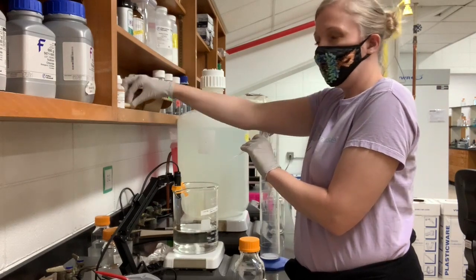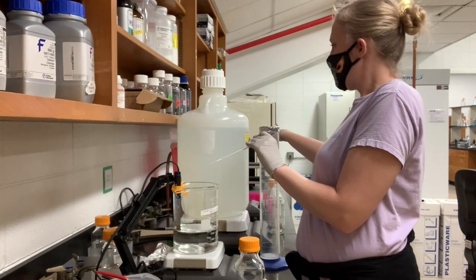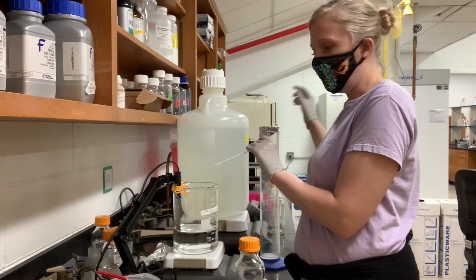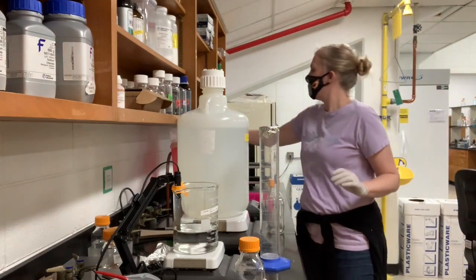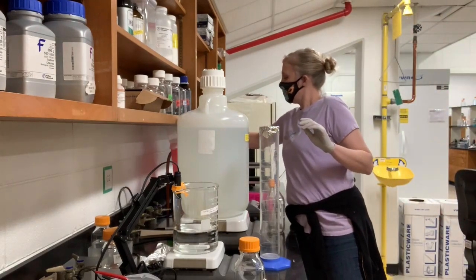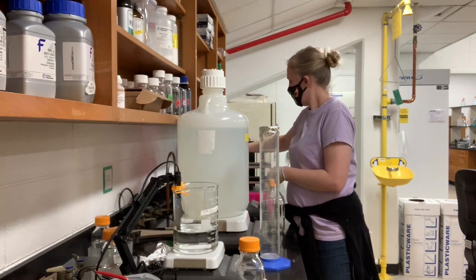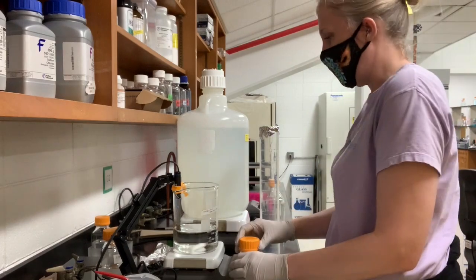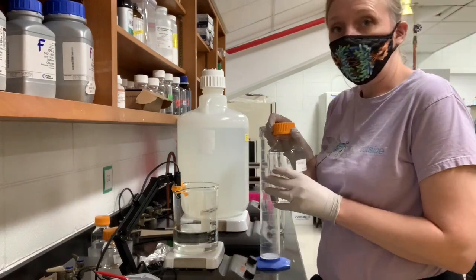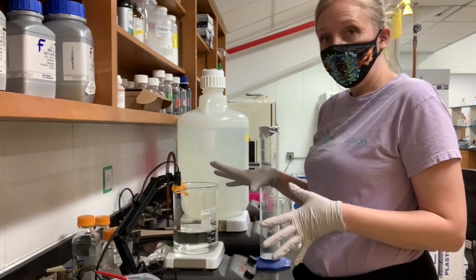I'm going to remove this bulb and put it back on the shelf, and there's a medical waste, like a hard red plastic container over to the right that can be used to put this pasteur pipette in. It looks like this. So that's where we put sharp things like scalpels or breakable glasses. I'm going to put up my strong base, and now I'm finished with pHing this solution.